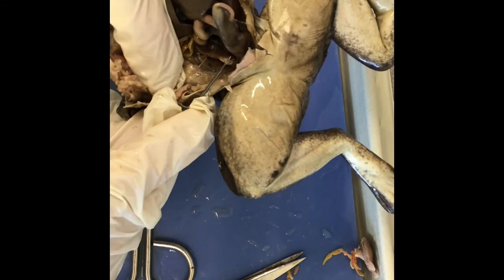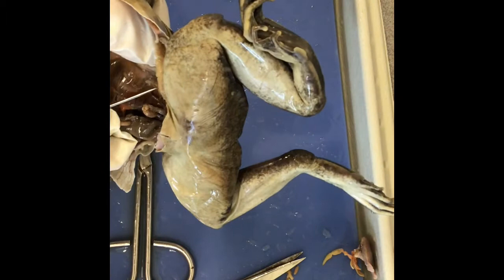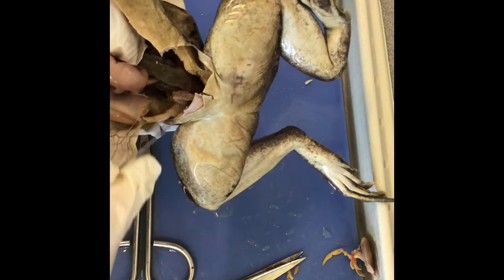It does have testes, which is this white kidney-bean-shaped thing. And then the kidneys are along the backbone. I know it's not a female — there are no eggs. The oviducts are on this side, over here. And then that is the other testes, and the kidney on this side. So there are two kidneys along the flank. This is the stomach and large intestines. This was the bladder, the sac here. And then the cloaca would be the opening that leads to the outside.